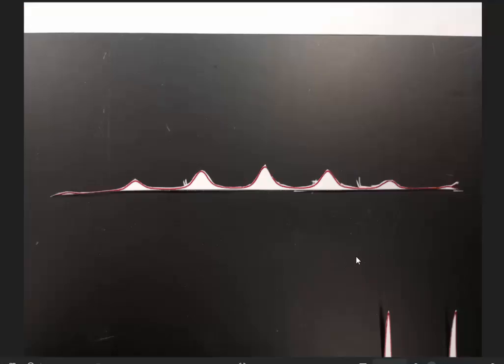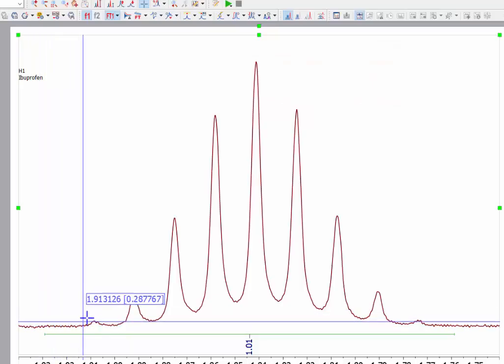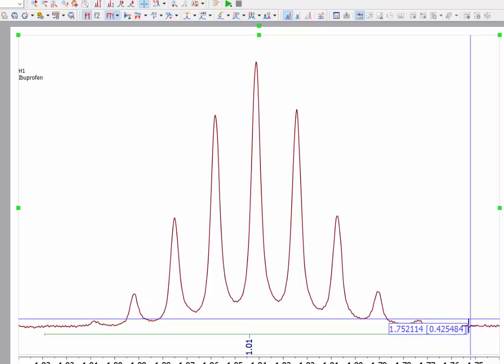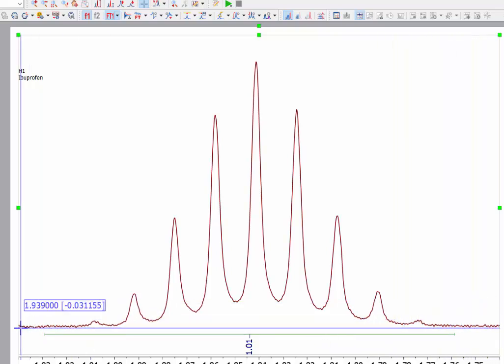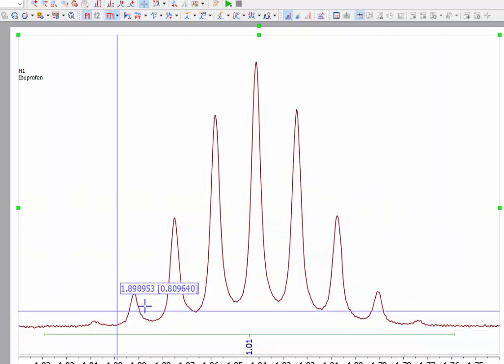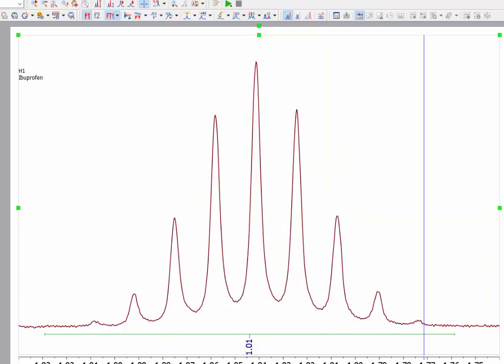When attempting to cut out the nonet, it is not even possible to distinguish the nonet parts in the paper, so I reduced it to a septet, but then I had to have some non-zero paper on both sides in order to cut this part out. And this, by the way, is a meaningful finding. If you look at the level of intensity with which I've zoomed in, you can now see deviations in the baseline, and when you are integrating this entire peak, we are integrating some of that noise, and that will have a tendency to disturb the integral of this peak.